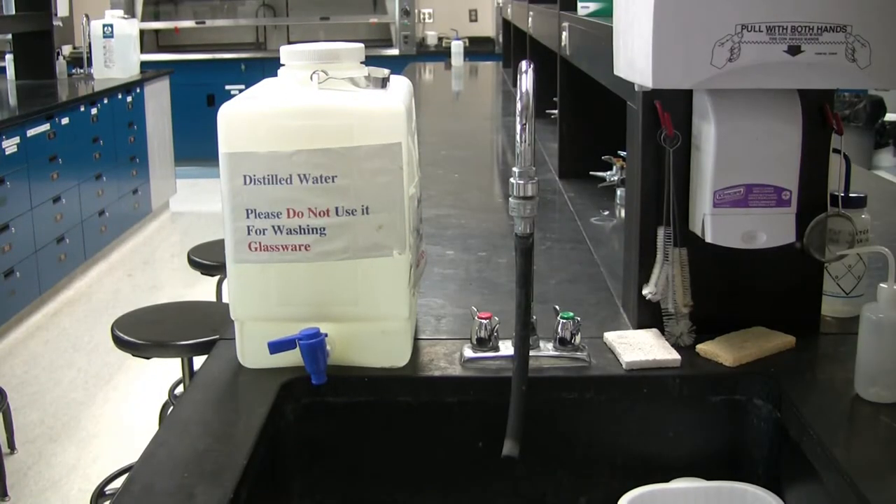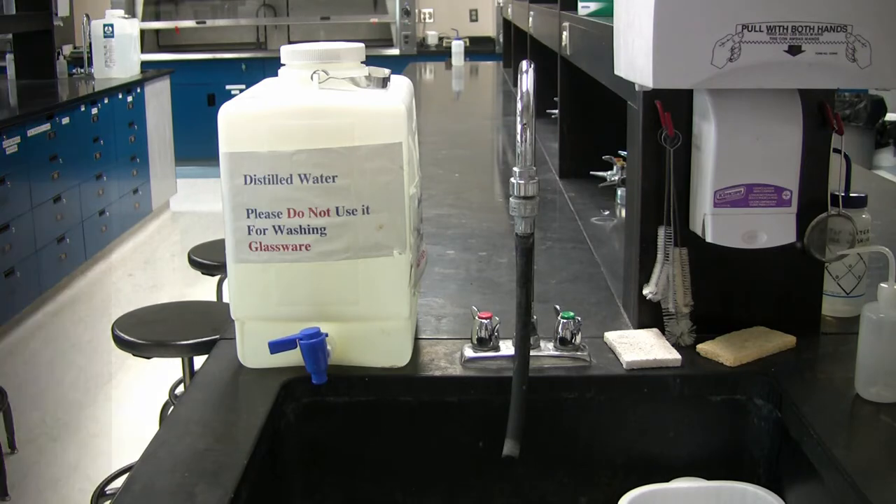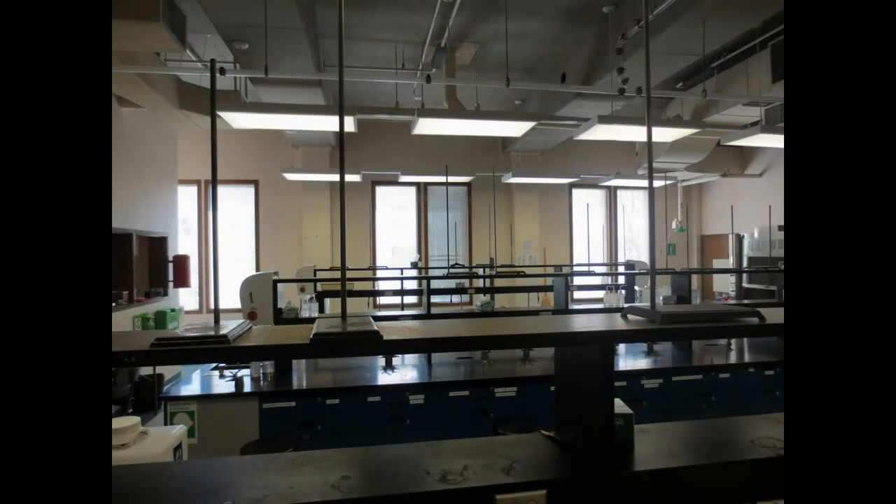On either side of the lab benches, there are sets of sinks — distilled water, which is only used for laboratory procedures, and tap water, which is used for cleaning — as well as brushes, sponges, and sieves for cleaning. Retort stands are on top of these.